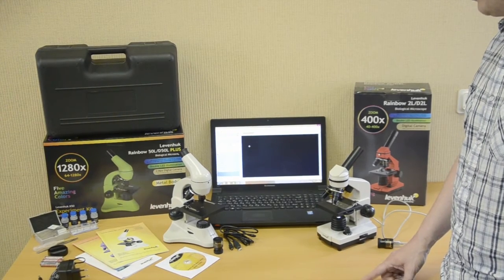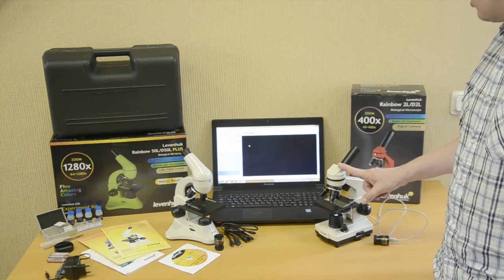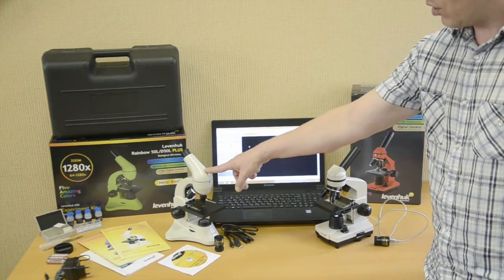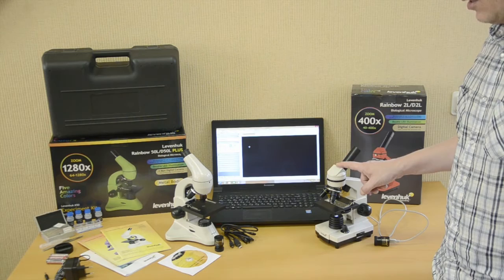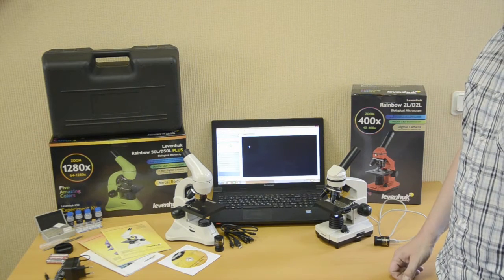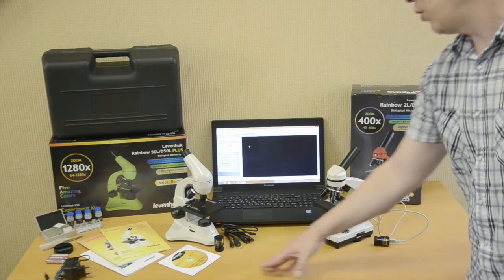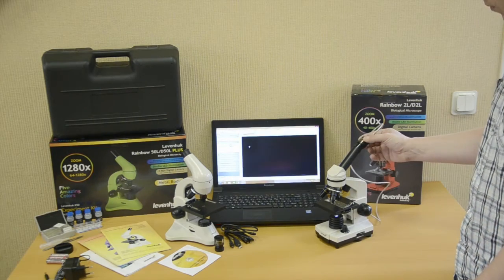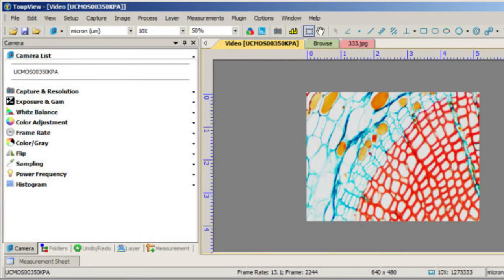The Levenhuk Rainbow microscope family also has two digital models. The body is plastic in the D2L and metal in the D50L Plus model. The digital camera is 2 megapixels for the Rainbow D50L Plus or 0.3 megapixels for the Rainbow D2L. The maximum magnification is 1280X in the D50L Plus and 400X in the D2L. Both models come with an experiment kit, and the Rainbow D50L Plus also has a plastic case. Camera connection is simple: run the Levenhuk TupView software on your PC, connect the USB cable to the PC and camera, insert the camera into the eyepiece tube in place of the eyepiece, and adjust sharpness with the focusing wheel. The Levenhuk TupView application allows editing and saving captured images or videos.